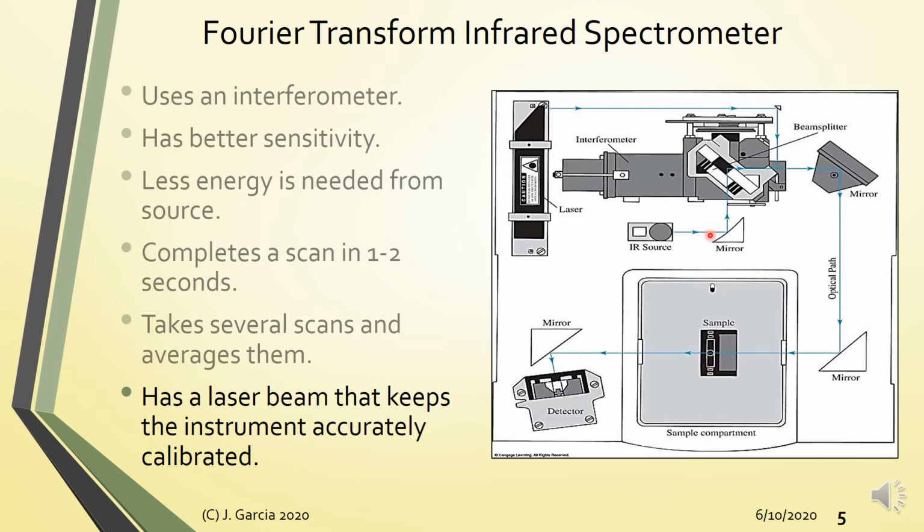And isang another important na kailangan maalala sa FTIR spectrometers is that sensitive ito sa relative humidity ng kwarto. Kaya nga usually if you have an FTIR instrument sa lab ninyo, naka-separate na room. Alright, yung FTIR usually may 24 hours na aircon. Okay? And then meron kang control sa relative humidity.